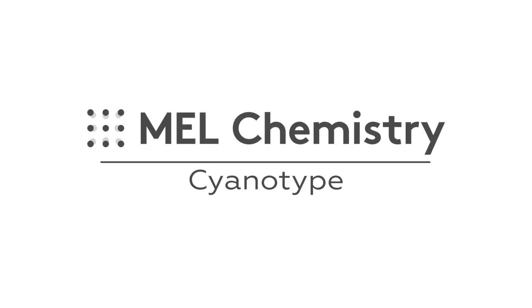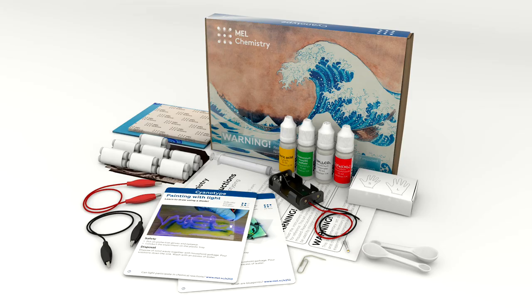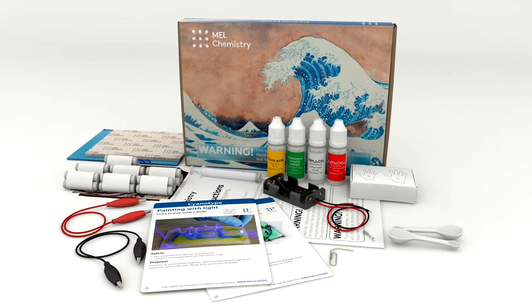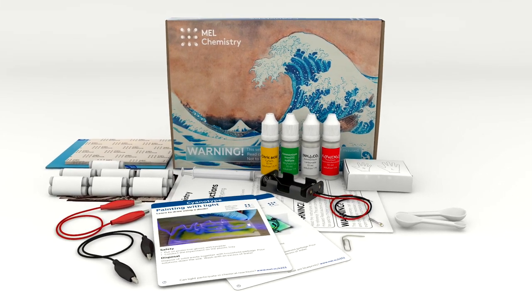Welcome to the wonderful world of chemistry. Today, with the help of the Cyanotype set by Melchemistry, we will learn how to create a photo print using a chemical reaction.